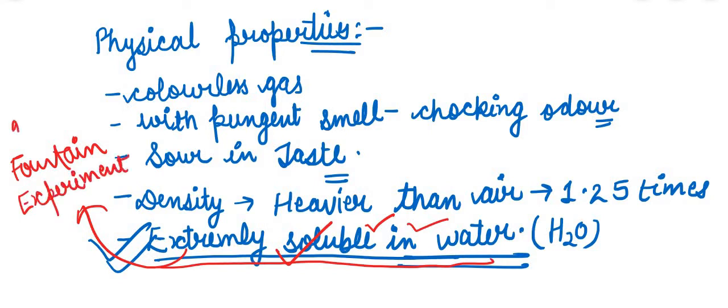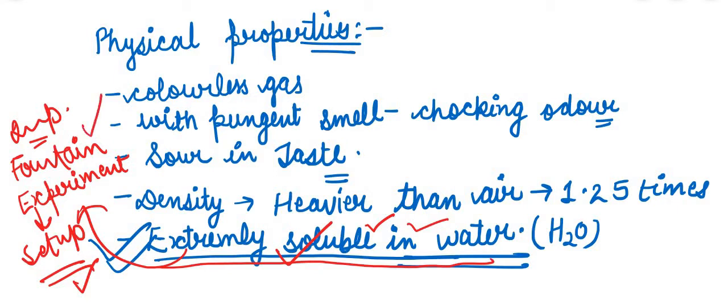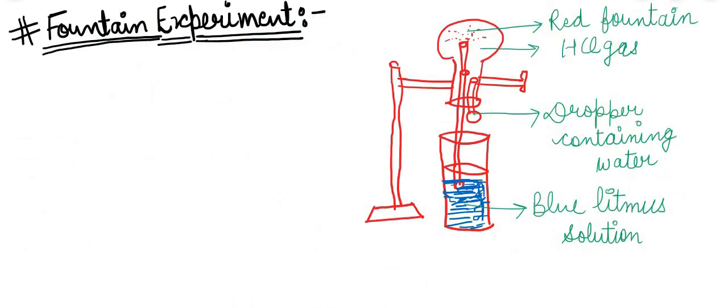A very important experiment, completely important, is about its setup, complete setup, its requirements, and how the experiment is performed. Directly it can be asked with the name of the fountain experiment only. So the fountain experiment will tell you about the solubility of HCl gas in water. Please keep in mind that the fountain experiment tells how this gas is soluble in water. Okay, let's talk about the fountain experiment first.